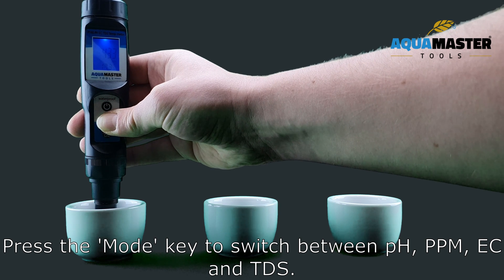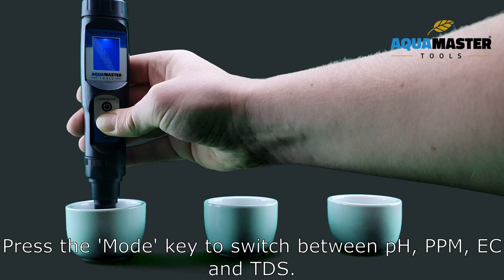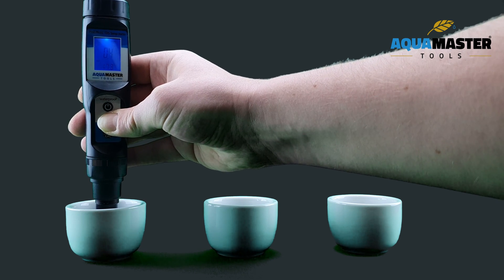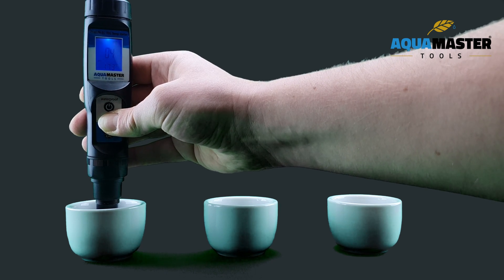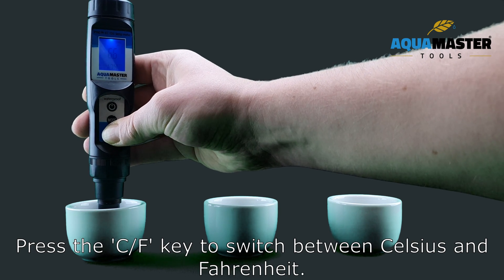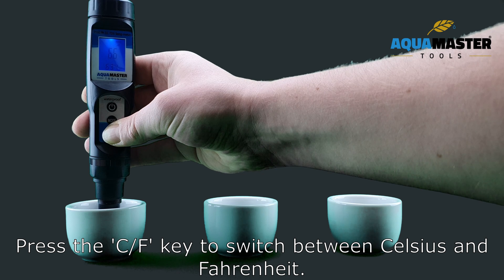Press the MODE key to switch between PH, PPM, EC, and TDS. Press the CF key to switch between Celsius and Fahrenheit.